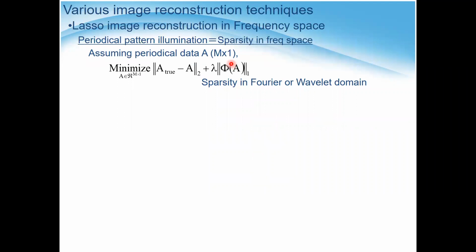The third reconstruction technique is LASSO image reconstruction, because we know that in this image we have a periodical pattern.